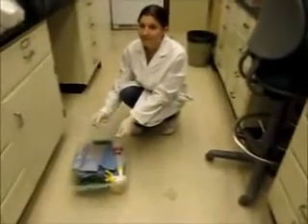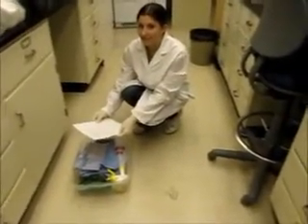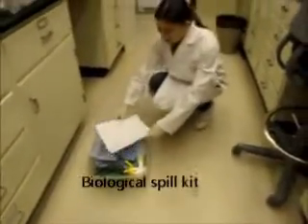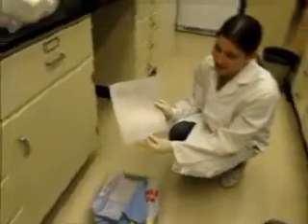So Kelly, where did you find the kit to clean up the spill? I found it in this drawer right here. Okay, and what's inside the kit? Inside the kit is a piece of paper telling you what's inside of it.